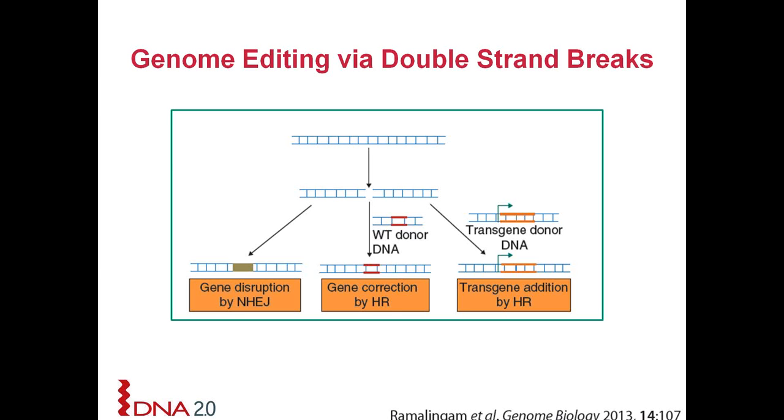That's a good question. I would say it would depend again on the host, like whether there's a precedent for doing it with single-stranded DNA or not in that host system. I've heard of that done certainly in E. coli and other organisms like that. Mammalian, I'm not 100% sure, but I don't see why not. But I would say check with what has been done in terms of editing by more traditional methods in those hosts, and then that should work just fine with CRISPR as well.